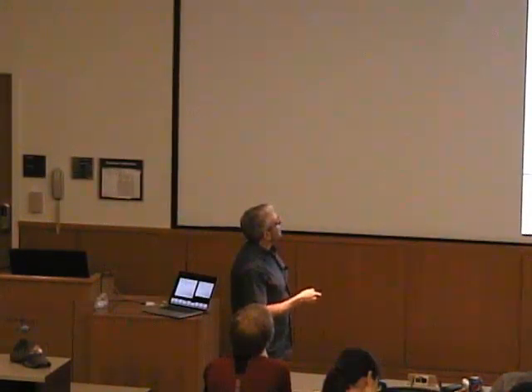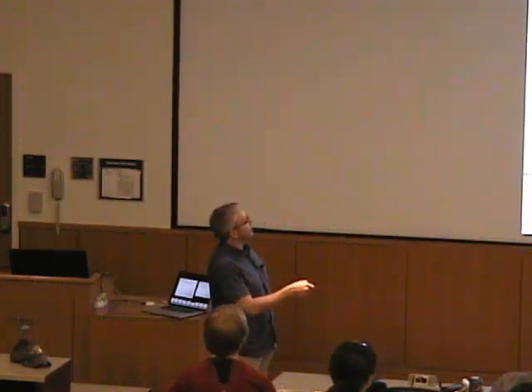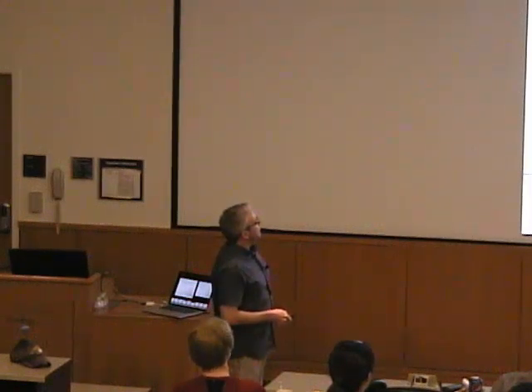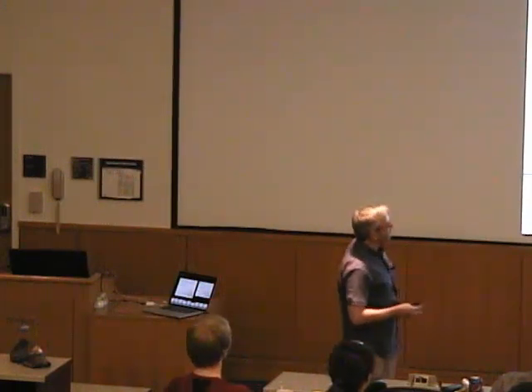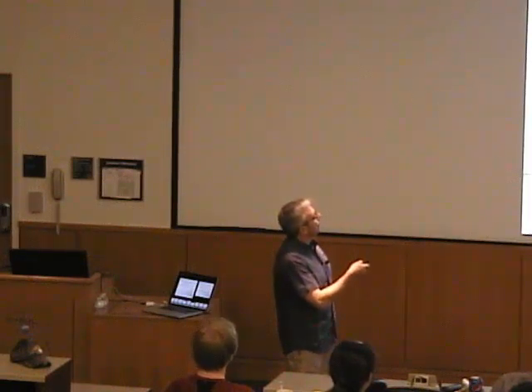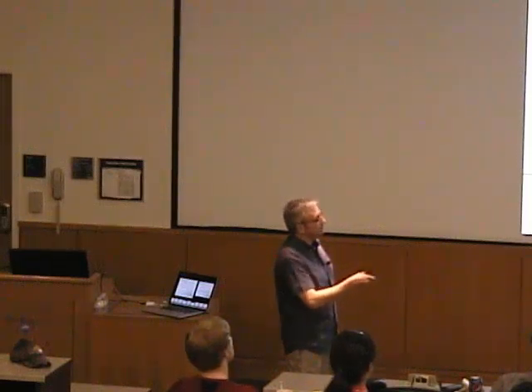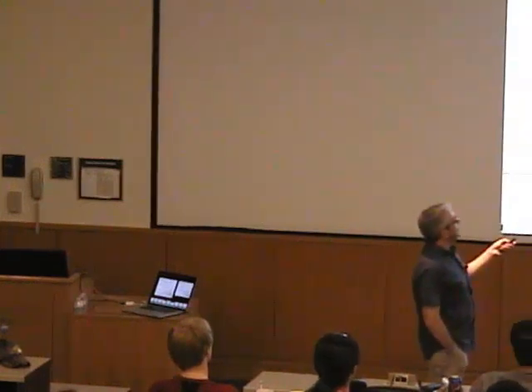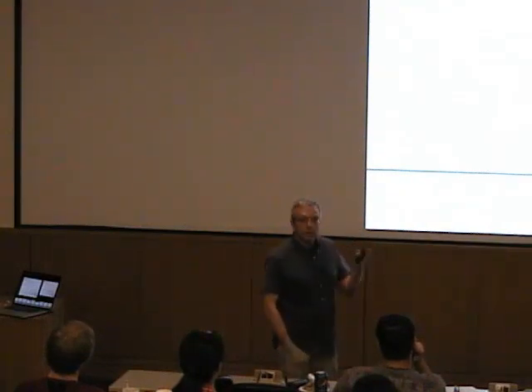by actually going back to the electron density function. So this is what you would like to calculate, but you cannot calculate it because you don't have phase angles, right? So a gentleman called Arthur Patterson went along and said, well, then let's see what we can do. And if you actually, there are many ways of explaining this, but if, for example, you square this function, and you square the amplitudes, then you lose the phase angles here. It's again the complex function that if you square it, you fall back on the real axis. You lose the sine term, and you go back to a cosine, and you get a function that looks kind of similar, but that is not a Fourier transform anymore.